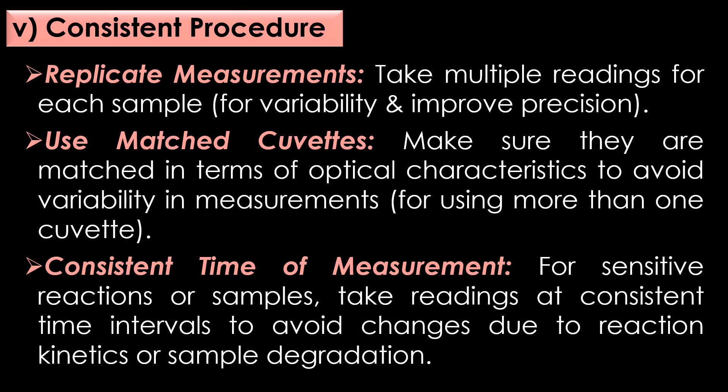Preventive measures in consistent procedures. First, replicate measurements: take multiple readings for each sample to account for variability and improve precision. Second, use matched cuvettes: if using more than one cuvette, make sure they are matched in terms of optical characteristics to avoid variability in measurements. Third, consistent time of measurement: for sensitive reactions or samples, take readings at consistent time intervals to avoid changes due to reaction kinetics or sample degradation.